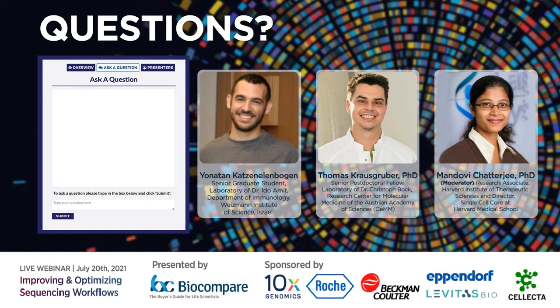So I think the most intuitive thing to say in this matter is that sample prep is maybe the most important part of the entire experimental design. First, because we're dealing with highly delicate systems sometimes, and we're trying to catch even one or two molecules.